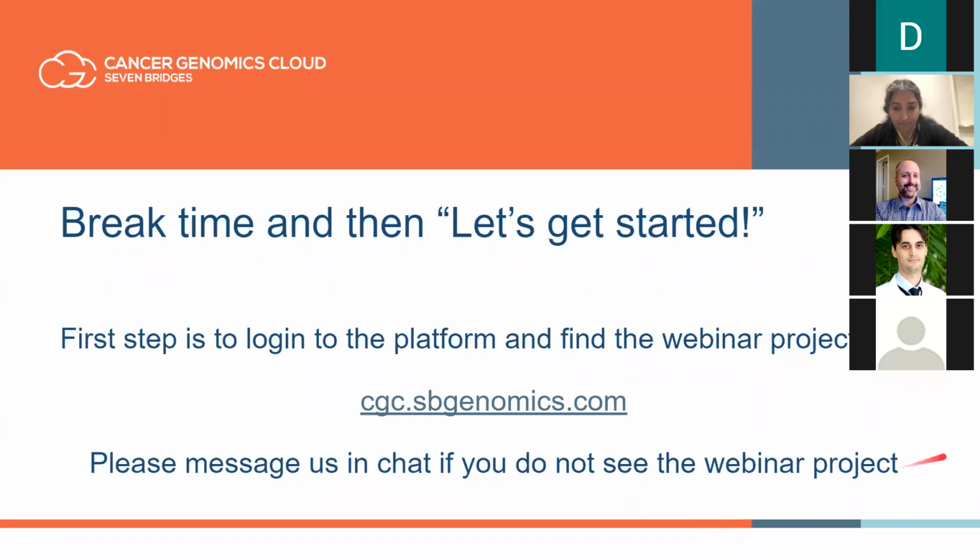I had a question for David. The project that he shared with us, you mentioned the task for identification of the peptides was not a batch job, right? Would you also be able to share a task that you showed where you set it up as a batch job? I think having that task shared will also be helpful to understand how to run a batch job for the first step. Absolutely, and we're going to get into that in just a moment. Great, thank you. Great question, Kritika.